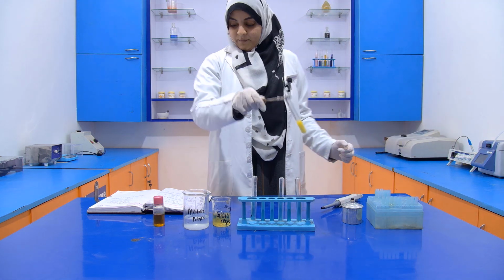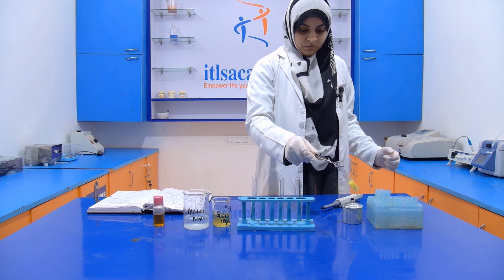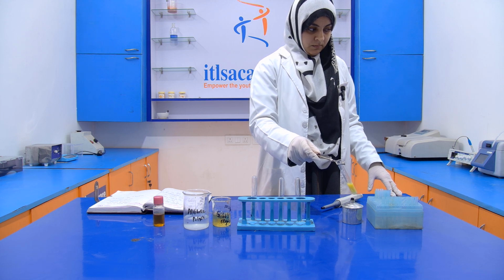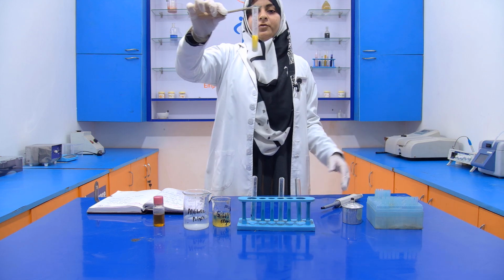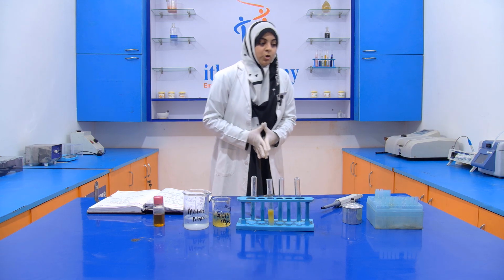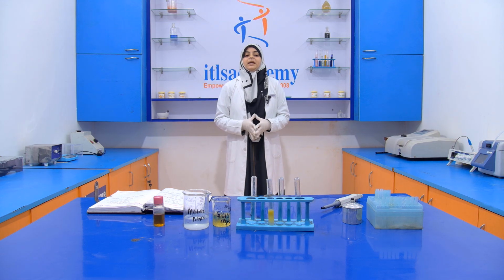Now we have to warm it. Now see, there is no development of blue color. If the blue color is developed, then it means that mobile oil is present. So this is all about the detection of mobile oil in an edible oil.